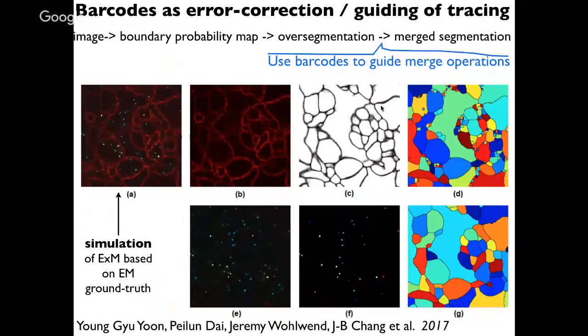Now, how do we fundamentally put all these things together? So we're also thinking about computational strategies that you could use, where the morphology information that you would get from a high resolution expansion microscopy picture of the cell membranes, kind of like an electron microscope image, except probably at still somewhat worse spatial resolution than the best that one can do with electron microscopy, a la FIBSEM that was talked about.